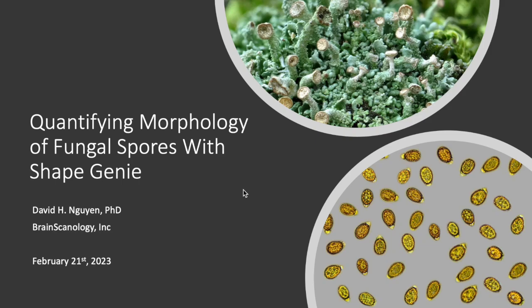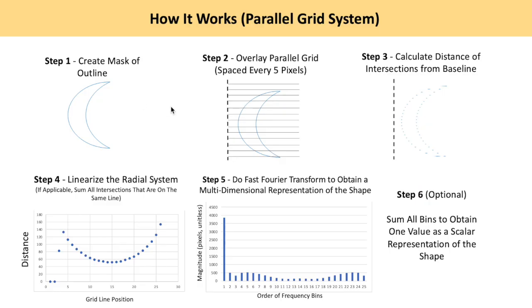In this presentation, I'm going to talk about how to quantify the morphology of fungal spores using ShapeGenie. To begin, let me explain how the core algorithm of ShapeGenie works.